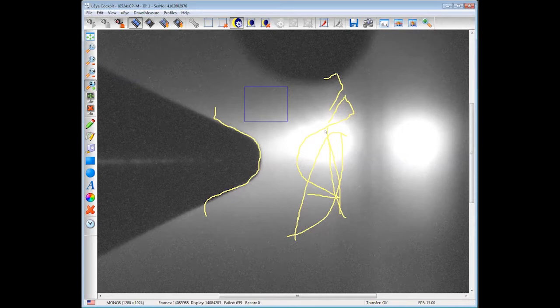If you want to change the probing depth, we use an X-ray source, which is aluminum K-alpha with an energy of 1486 eV. And then we also have a UV source, an ultraviolet source. So yes, you can also see some molecules, but of course valence bands are not so easy to analyze. It's not used so often.